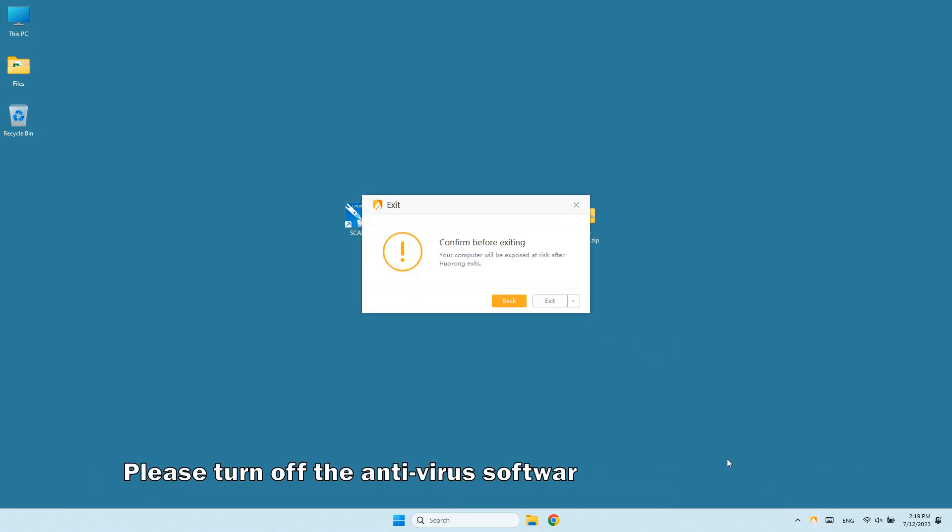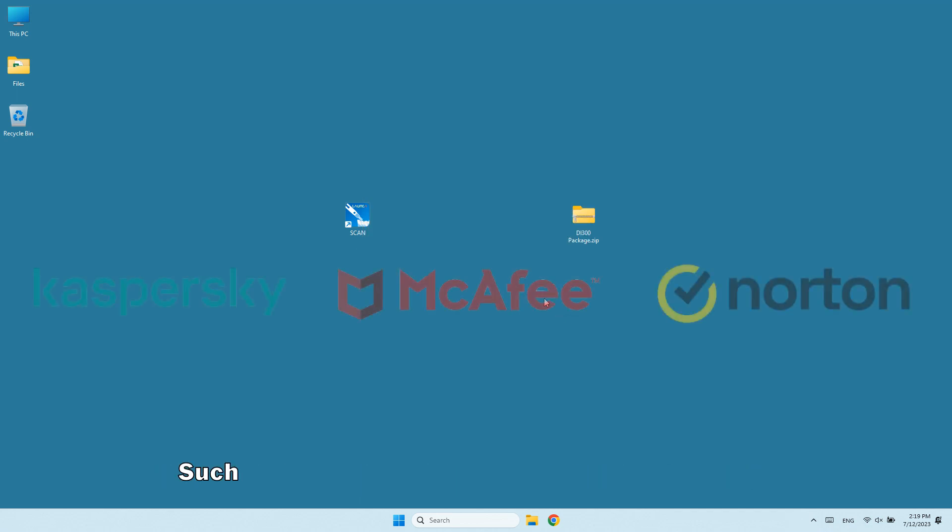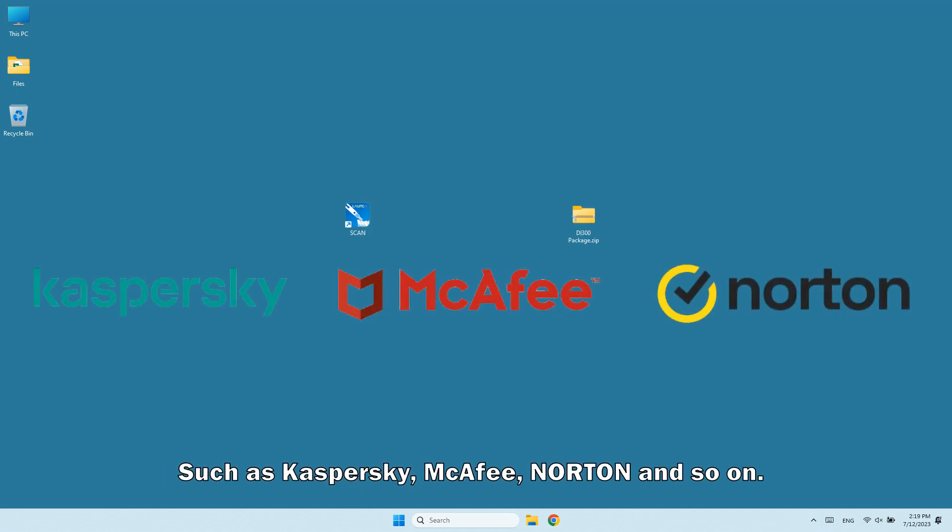Please turn off the antivirus software on your computer, such as Kaspersky, McAfee, Norton, and so on.